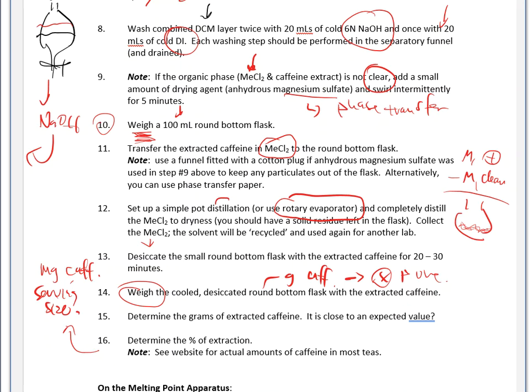So what that means is that go to our box that we bring into the lab. Sometimes the box will have the milligram amount stamped on the serving size, and it will tell you 1 tea bag is equivalent to this many milligrams of caffeine. So if we have brought in a box like that, make sure that you get that number off of there, because you will need that value sooner or later.